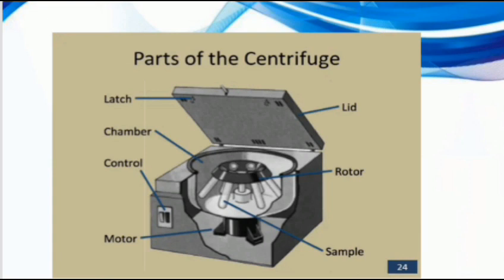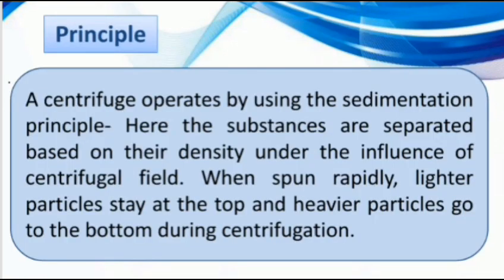There is a chamber which contains the internal cavity of the centrifuge. At last, there is a control center due to which the machine is powered on. If we talk about the principle of centrifugation, basically a centrifuge operates by using the sedimentation principle. What is sedimentation here? Basically, it is a phenomenon where suspended material settles out of fluids by gravity.